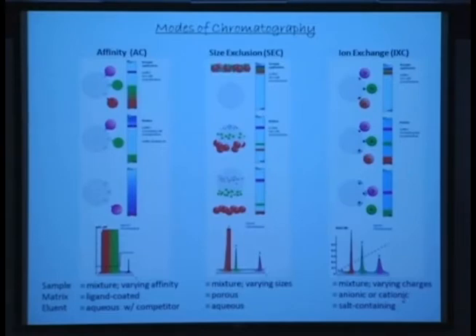That is the interesting part, because carbohydrates are typically polymers. For polymers, one of the biophysical properties is the molecular weight. Not only just molecular weight, but the number average molecular weight, or the weight average molecular weight, or the peak average molecular weight, or the viscosity average molecular weight. So there are several molecular weights as far as polymers are concerned. And this is a technique that is typically used most commonly.